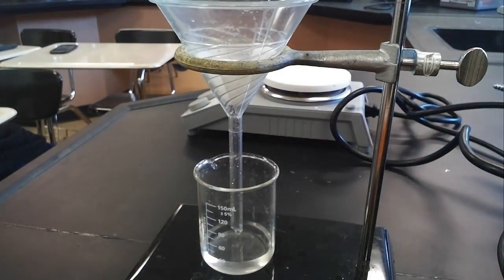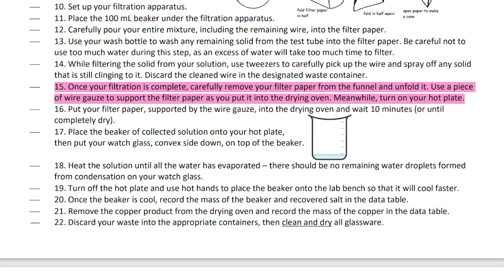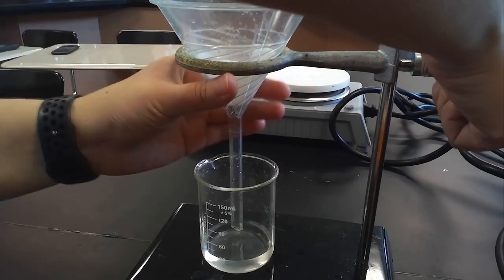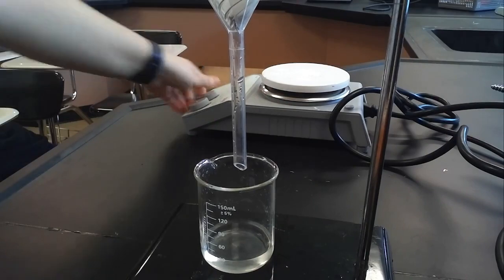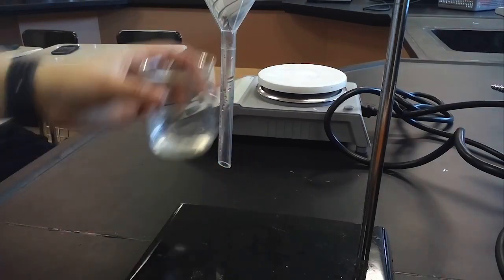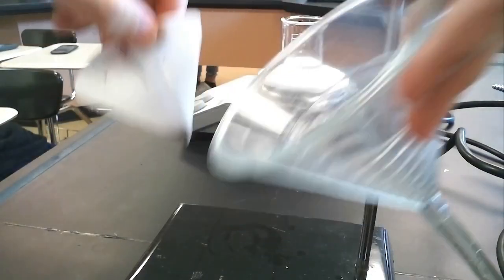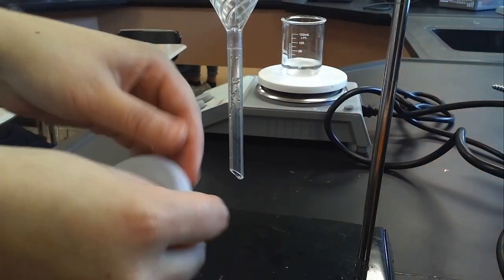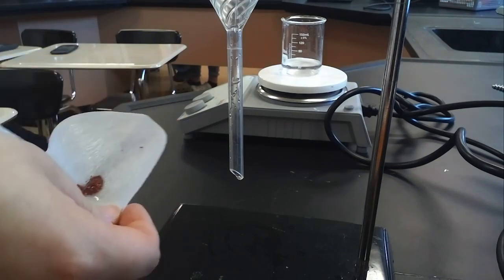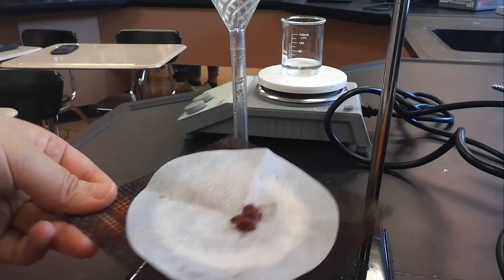Once filtration is complete, I carefully remove the filter paper from the funnel, unfold it, and use a piece of wire gauze to support it as I put it into the drying oven. Meanwhile I turn on my hot plate. I place my clear AlCl₃ solution onto the hot plate. The filter paper still has some liquid in it but is no longer dripping, so I take it unfolded with my name side up and put it into the drying oven.